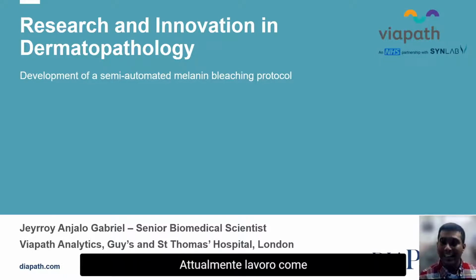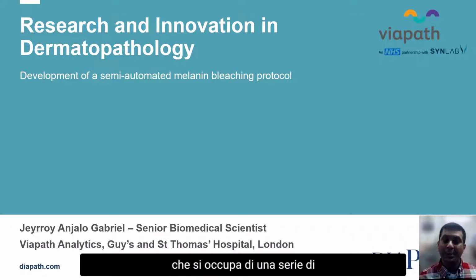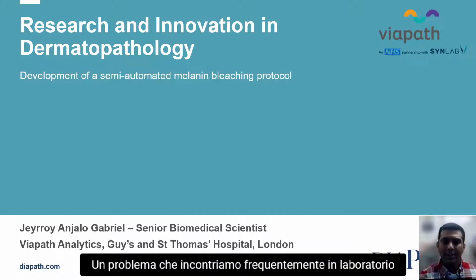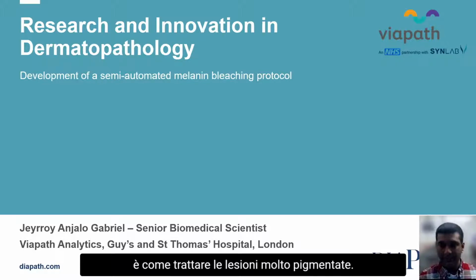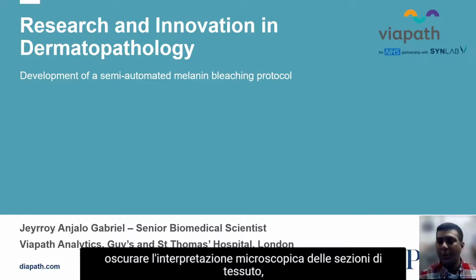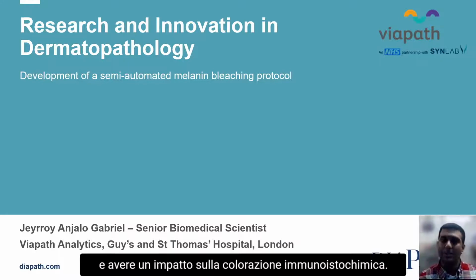Currently, I work as a senior biomedical scientist in St. John's Dermatopathology Laboratory at St. Thomas's Hospital in London, which is a specialized histology lab that deals with an array of cutaneous disorders ranging from malignancies to autoimmune. A common problem we encounter in the lab is how to deal with very heavily pigmented lesions. This can be quite problematic because the melanin can obscure the microscopic interpretation of the tissue sections. As well as that, it can mask antigen-antibody binding sites, which can impact immunohistochemical staining.